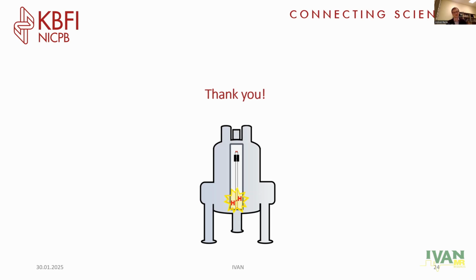And if you protonate something, it won't be able to bind electrostatically. So we need to control pH also to have quality control over what can coordinate and bind to this iridium catalyst and what cannot, and also to make sure that they do it in a reproducible and reliable manner. So most of this biomixture work now we do with different organic buffers in place.